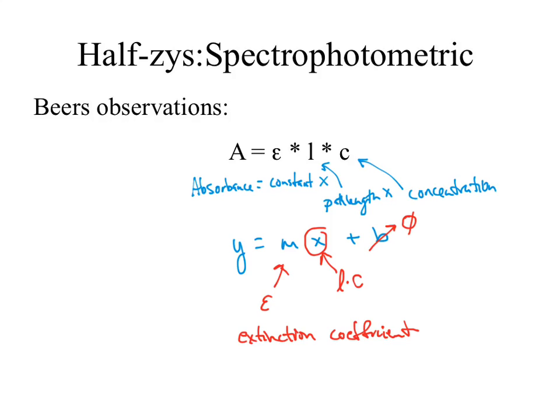What do we do? We make a digital eye. That digital eye is our absorption machine, or our spectrophotometer. What that will do is look at the absorption of light. So we can record for each of our individual concentrations the amount of light that passes through that sample, relate that to an absorbance, and then we can graph our concentration versus absorbance.